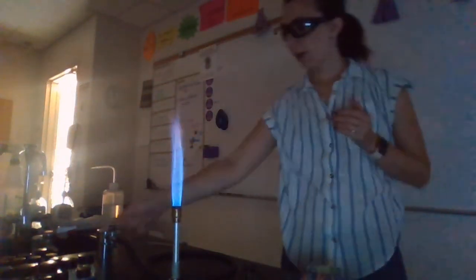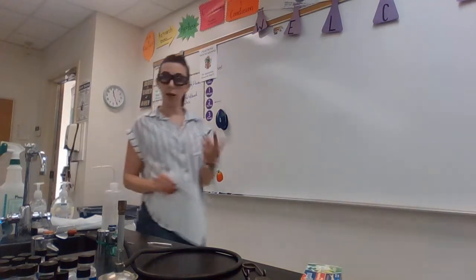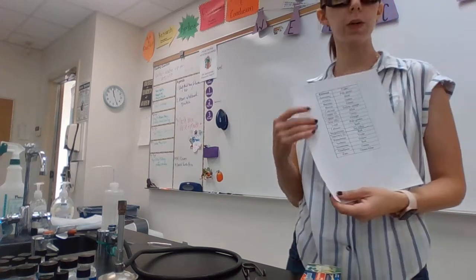When we're all done, we're going to turn our gas line off to the side, making it perpendicular to shut it. When it's parallel, that's when the gas is on. Then on our labs, we'll turn our lights back on. We'll record our colors that we have recorded, and we'll double check to see, okay, those are the colors we got. What elements can those be?